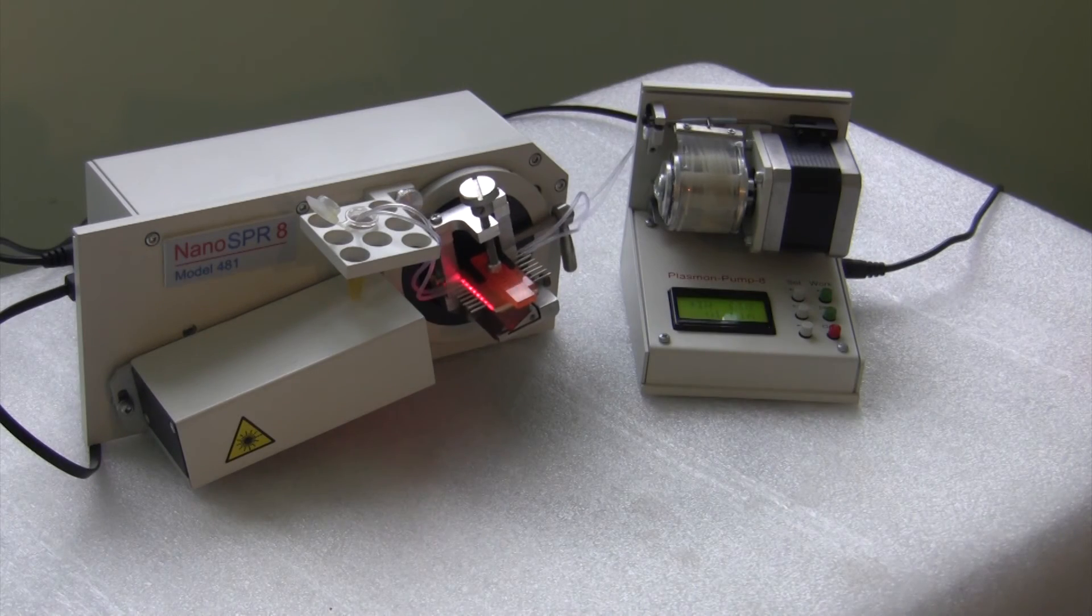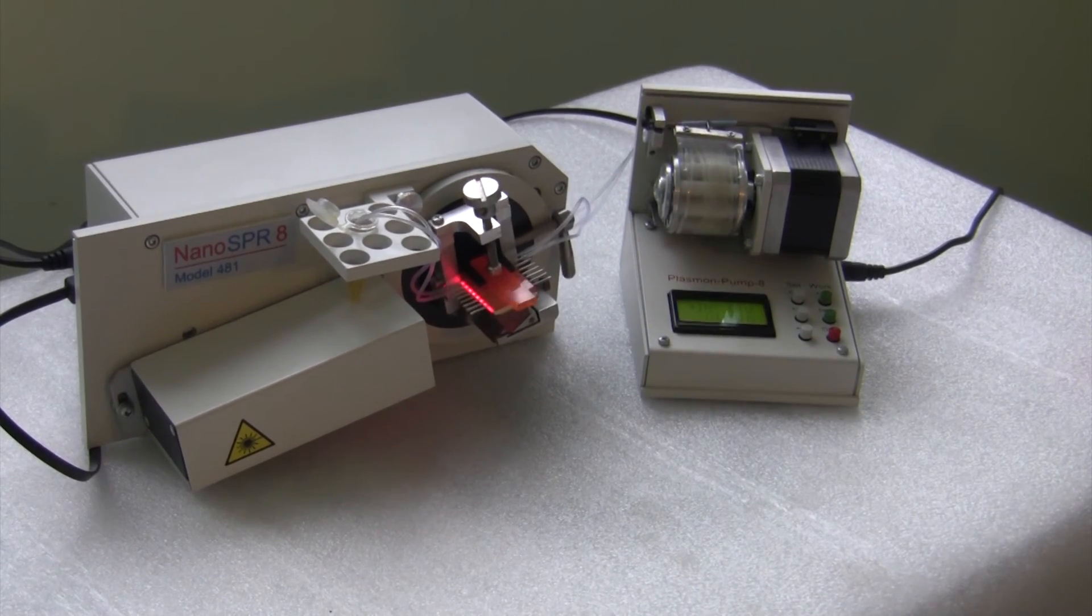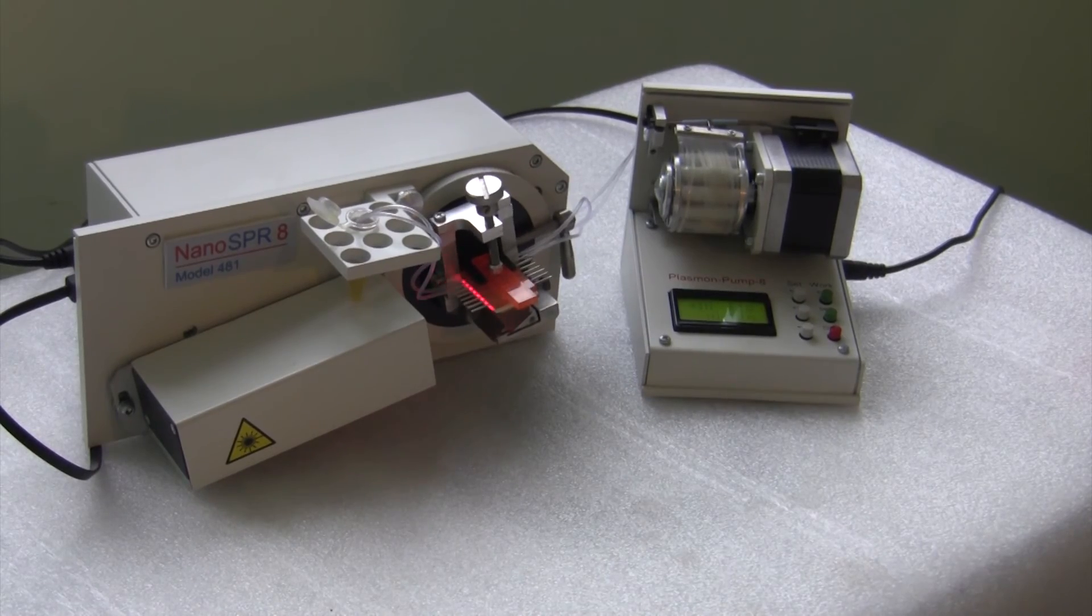Additionally, we are able to measure multiple data points in a short period of time by reducing the scanning range.